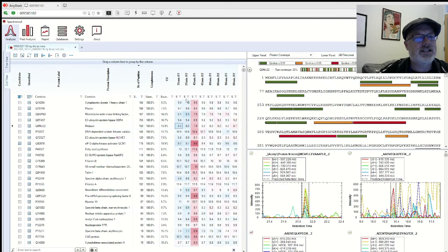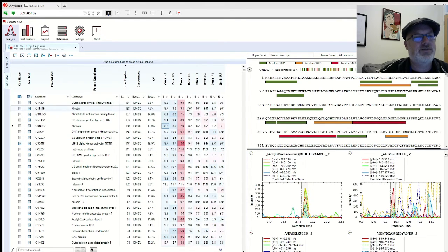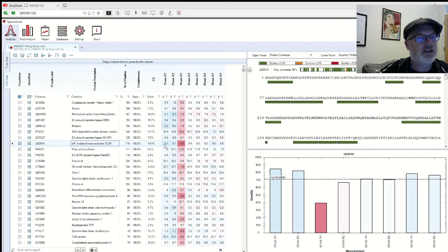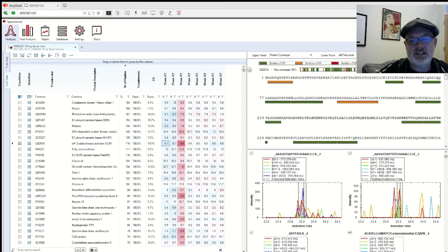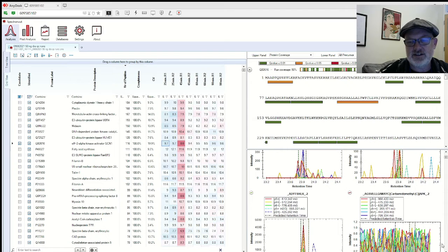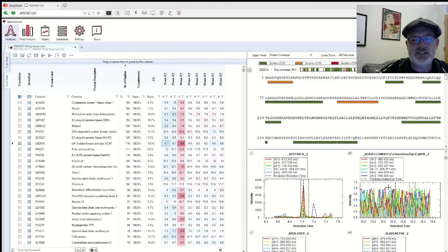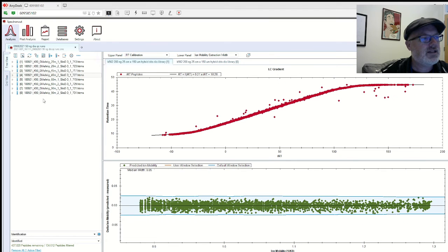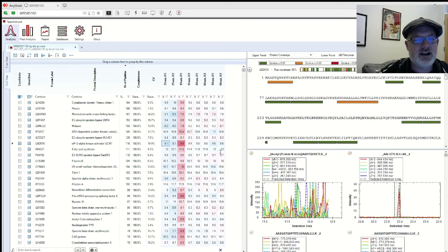Okay, so basically this is to get you started. This will show you the number of the proteins, how they're distributed across your different runs, whether they're differentially expressed, and for what proteins. Click on the name to get the bar, click on the numbers to look at the DIA data. If you see a lot of stuff that looks like background, that's probably because we have imputation on, and we're going to show you how to turn that off. I will show you what really good data looks like and what crappy data looks like. Okay, so we're going to go back to the tree view. I think that's going to get you started for now.